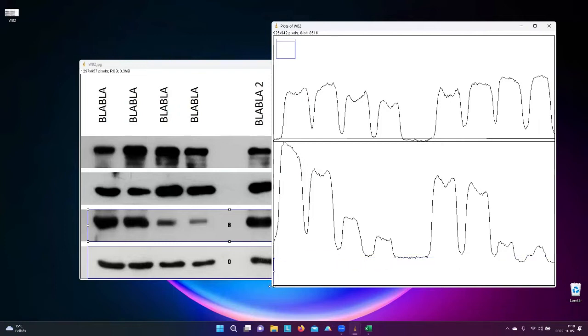So what I do now, I'm going a bit lower and then I'm going to use the lane, which should be straight. I know it's hard to find the straight one, but try to be as precise as you can. So now the question comes, how are you going to generate data from this one? It's easy. You just need to separate the peaks.